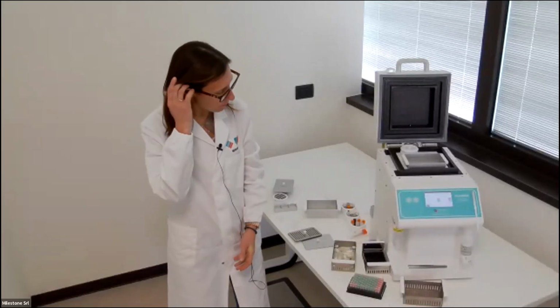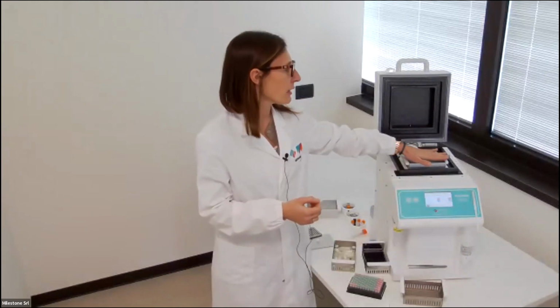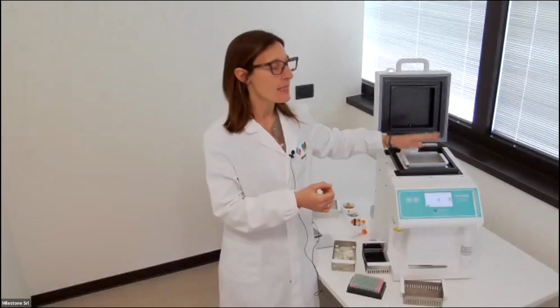Can this machine be used for rapid extemporaneous diagnosis for a routine histological lab? I mean, fresh frozen sections. In some labs, they freeze a sample in a cryo mold for frozen section. And this unit can be used. So you need to set up the kit for cryo mold, set up the -80 temperature and freeze the sample in a very fast way, having then a block that must be attached to the chuck of the cryostat, and then it's able to be cut.